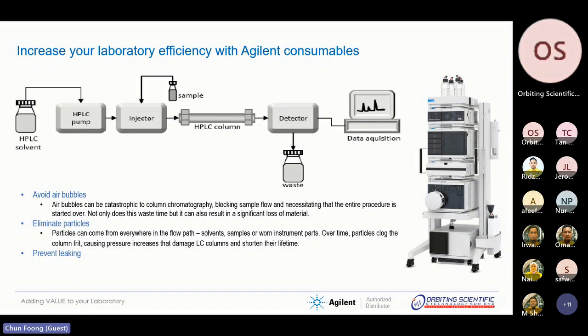The second thing is that we want to eliminate particles, because particles can come from everywhere in the flow path. They can come from the solvents, from the samples, or from the wear and tear of the instrument parts.